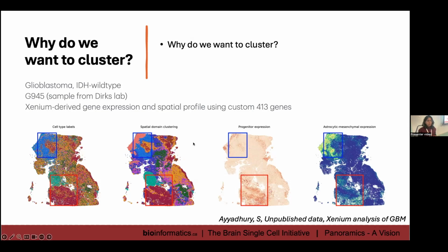And then what is it that you want to get from spatial clusters? You want to get that understanding that if I can find a domain, or I'm hoping to find a domain, that domain will have a certain function, or it will have a certain cell type or cell types that are aggregated. In this example, which I picked and chose for this presentation, it doesn't always work that way. In this case, you do find that you have two different spatial domains, and they are enriched by different cell state signatures. This is the best case scenario, but it doesn't always work that way.